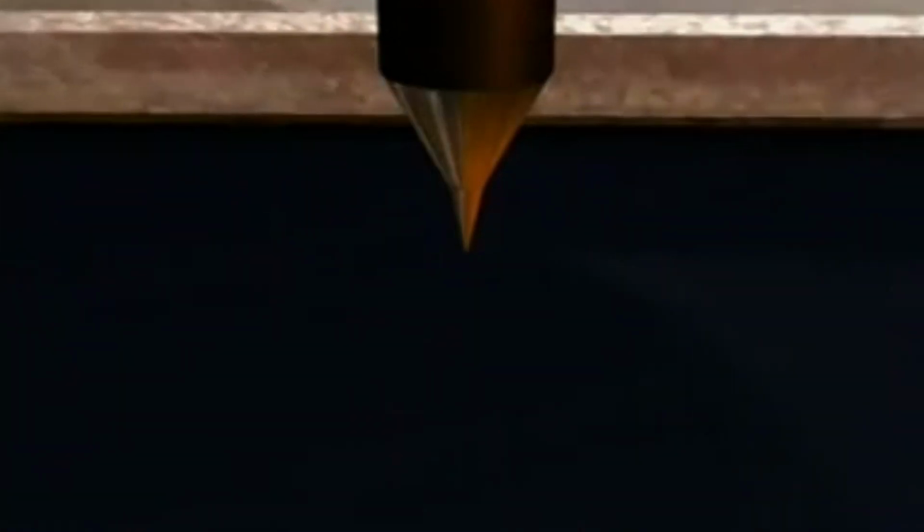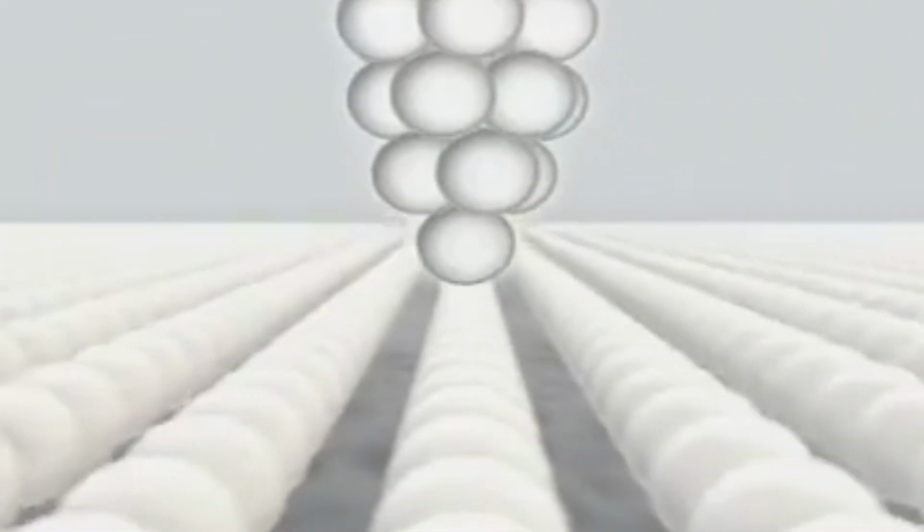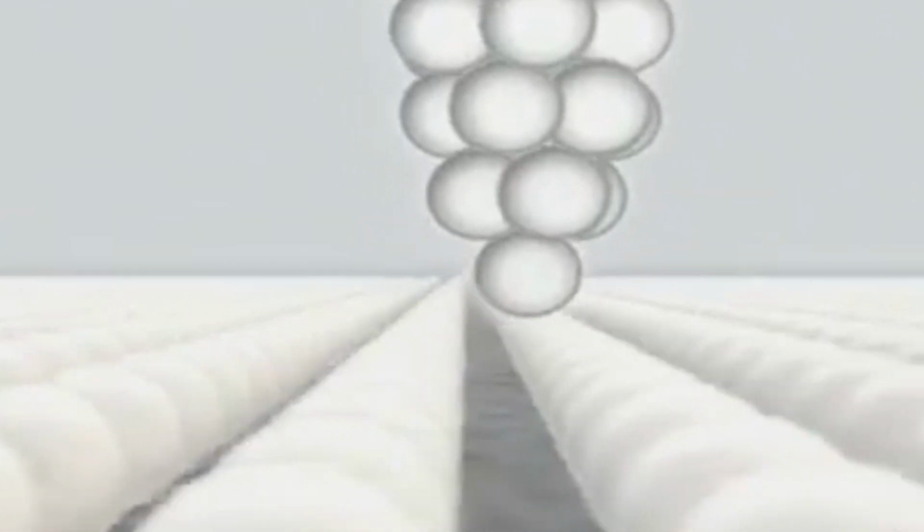The tip is typically made of silicon or silicon nitride and has a curvature radius in the nanometer range. Through the interactions between the tip and the substrate, we can not only characterize the molecular top layer of the surface, extracting information about parameters such as adhesion, conductivity, three-dimensional arrangement and the nature of surface molecules, but also modify the sample surface with extreme precision. This approach enables the technique known as scanning probe lithography.